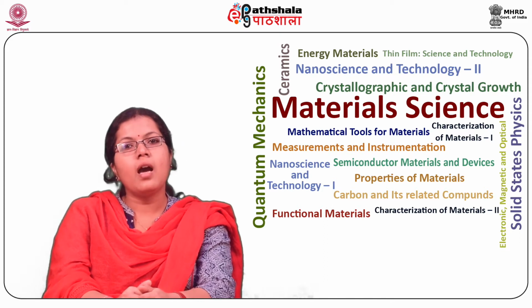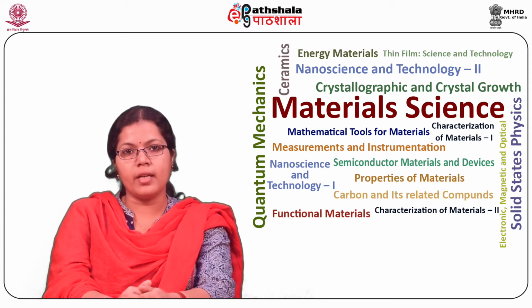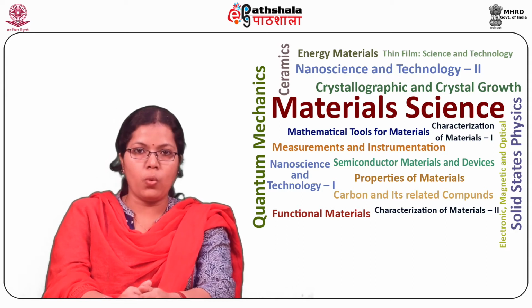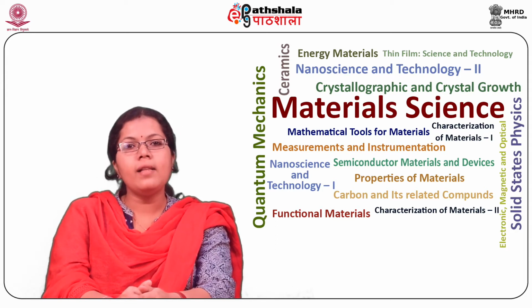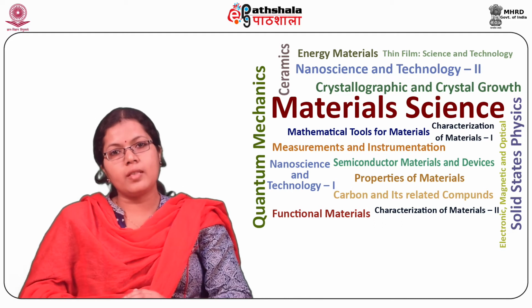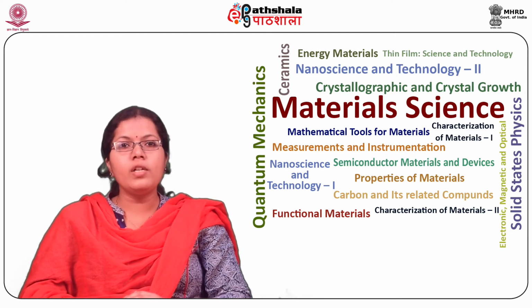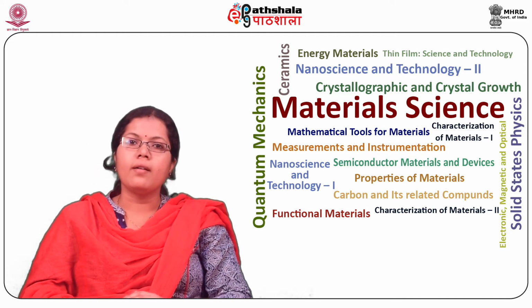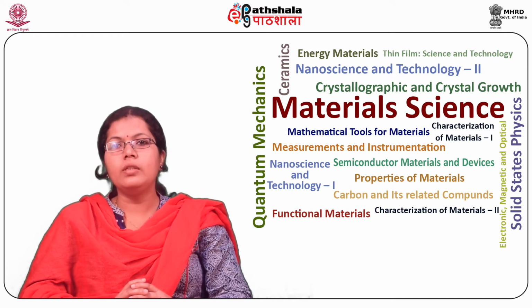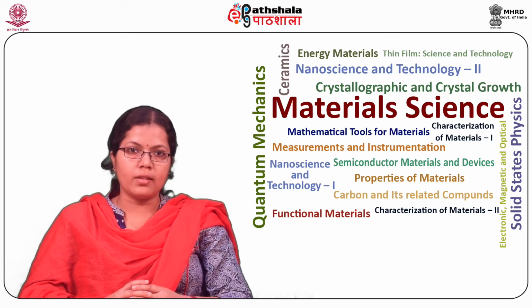Sustaining high electrical field gradients is similarly important to emission. So, a tip that is damaged might not produce electrons at all. As with the tungsten filament gun, the voltage difference between the first anode and the accelerating voltage on the cathode regulates the emission current.